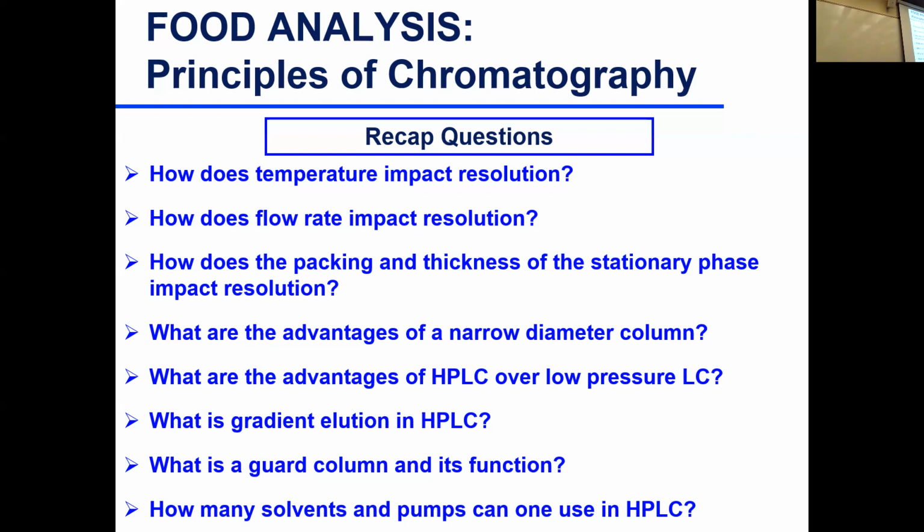We should optimize it. So if we increase it, what happens? If we decrease it, what happens? Okay. If you decrease it, I think the retention time is wider. Yes. And then if you increase it, thank you. It's usually sharper peaks. Yes.